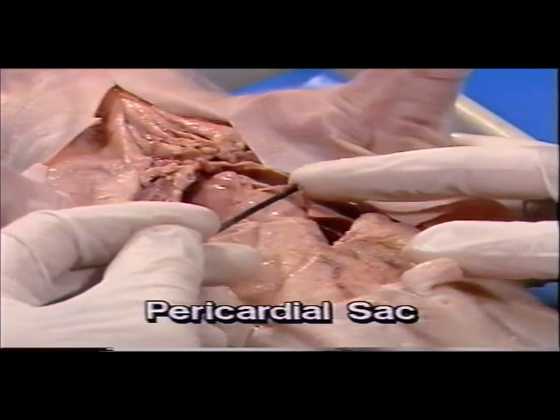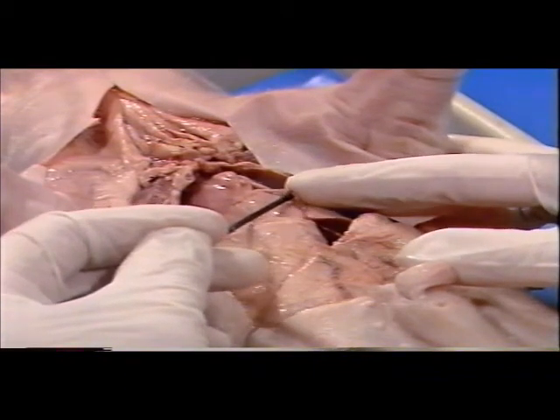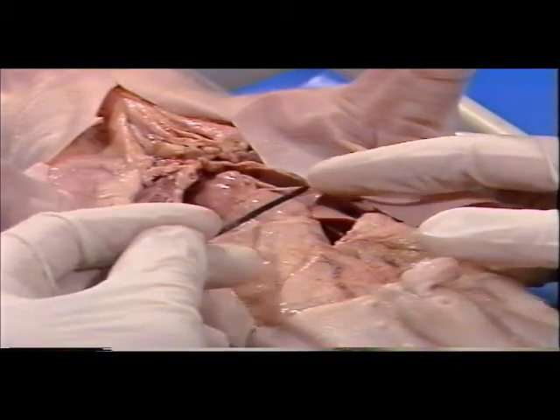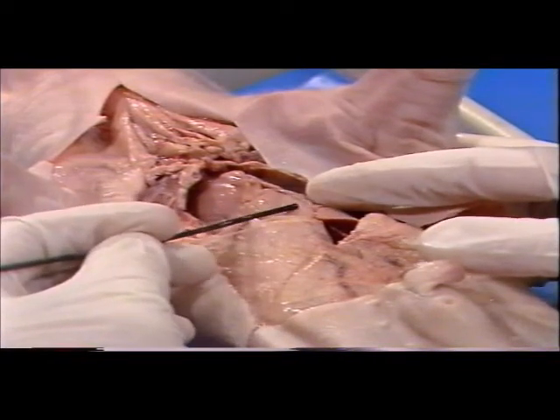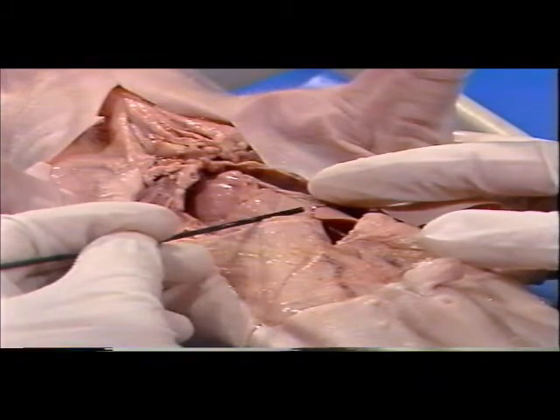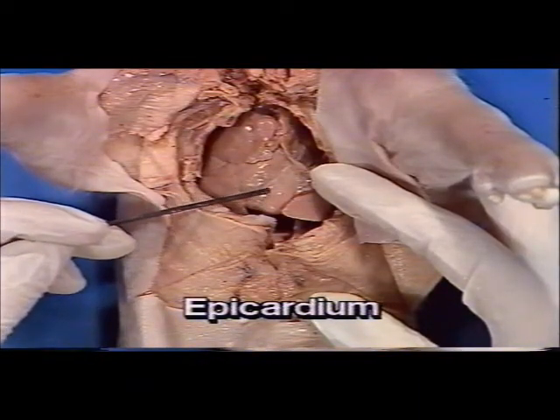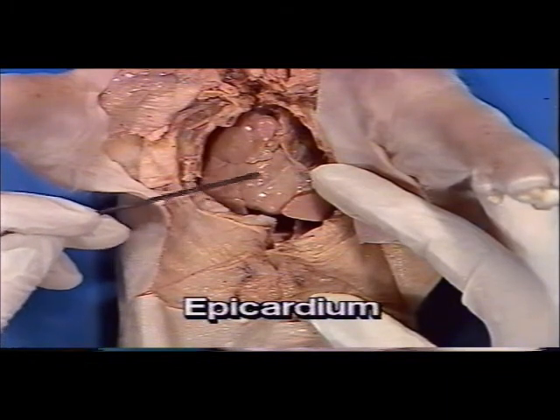This structure has a strong outer fiber network and an inner layer of smooth cells that glides over an equally smooth layer of cells on the surface of the heart. This layer is called the epicardium. A small amount of fluid is normally found between these layers.